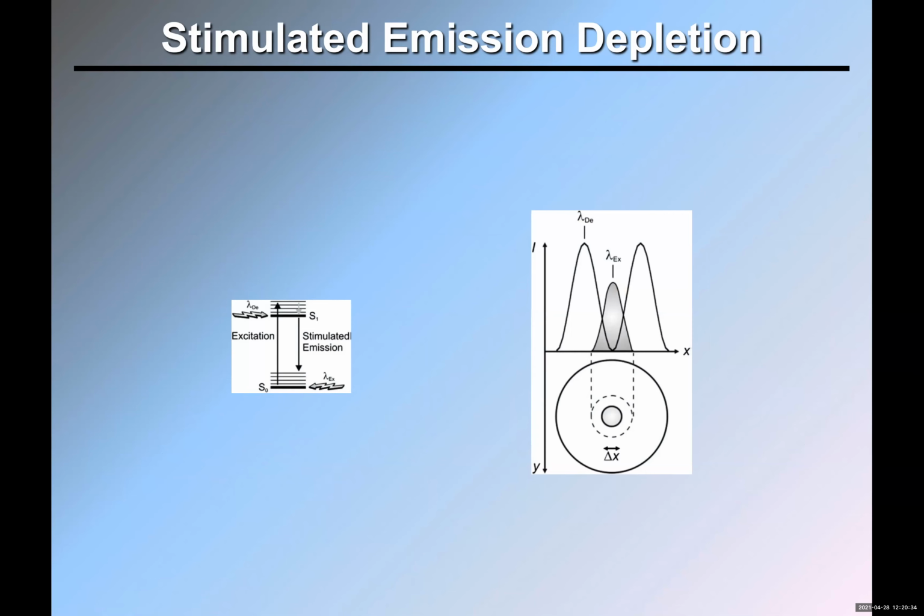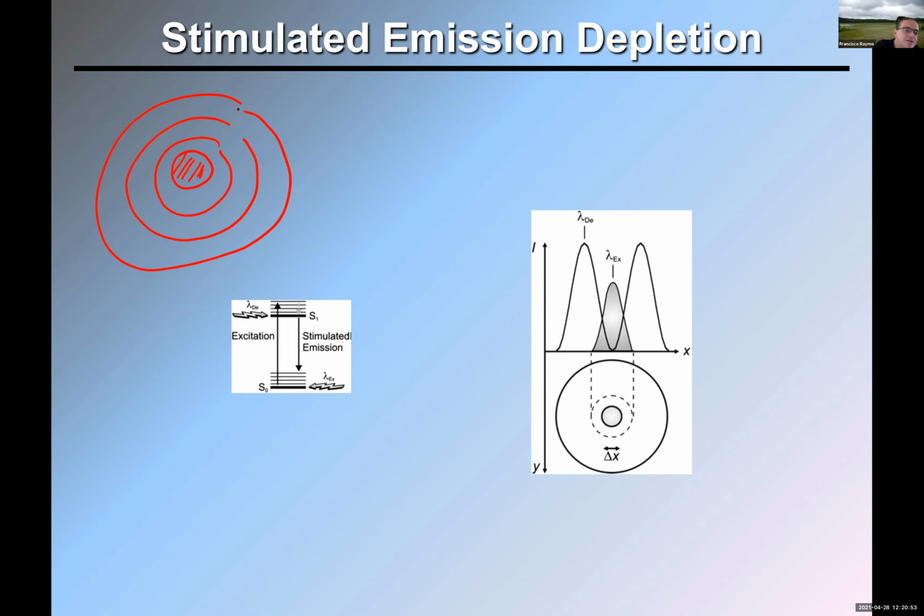15? Okay. So I told you earlier that the microscope is focusing, the objective lens is focusing the light in the form of a diffraction pattern, which has an inner disk and then a series of rings around. Okay. Now, most of the light is actually in this disk. So to simplify, we can get rid of the rings.